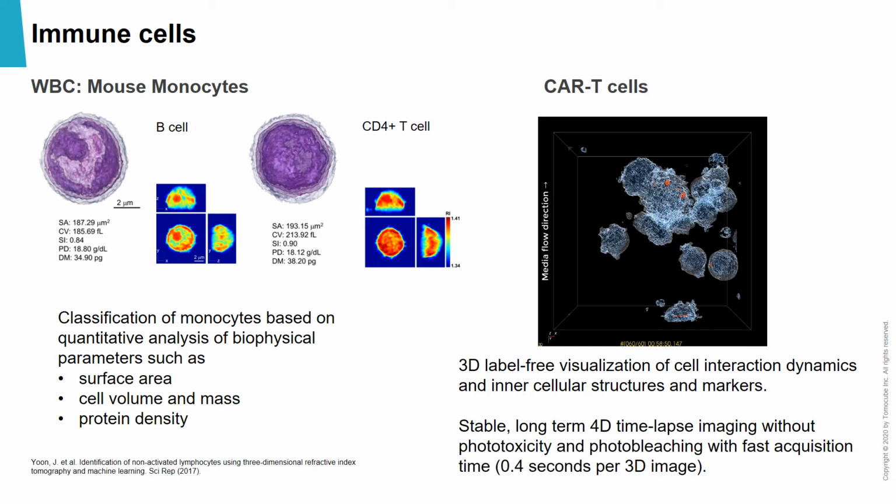And because this is viewable in 3D, we can tell whether the interactions or appendages are formed at the top or bottom or on the sides.